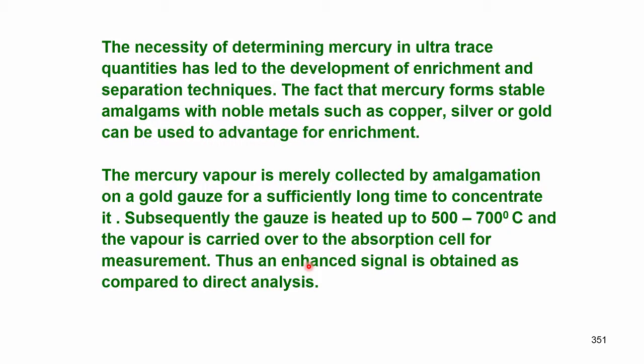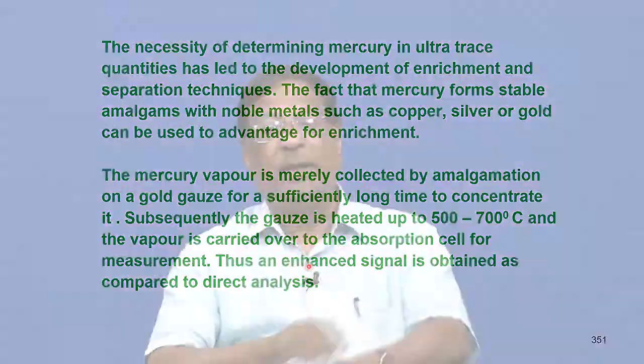The carryover problem means the signal is not totally free from the blank or from the previous sample. See, basically whenever we do chemical analysis, first we introduce the blank and then we introduce the first standard, then the second standard, third standard, etc. Then we put the sample, take the absorbance and refer to it.